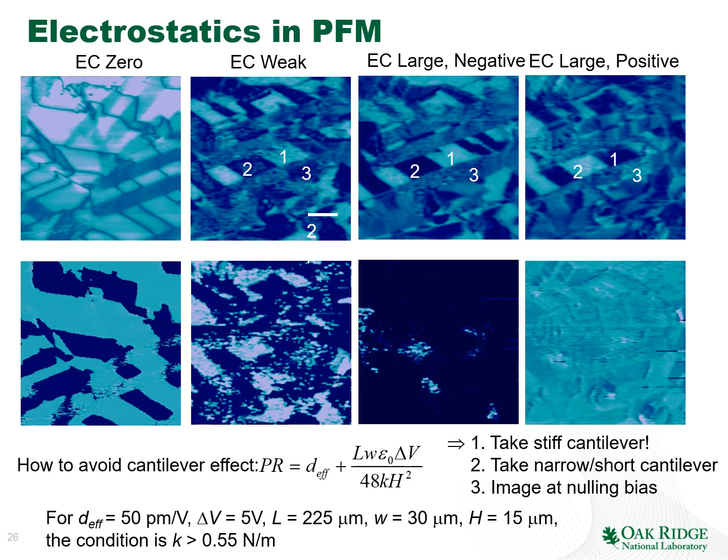So this is something to pay attention to. For materials with a strong electromechanical response, such as PZT, this tends to not be such a big problem. For materials with a weak electromechanical response, such as lithium niobate or thin films, this can be an extremely significant problem. The question is, can we roughly estimate how strong this effect will be and what does it depend on?